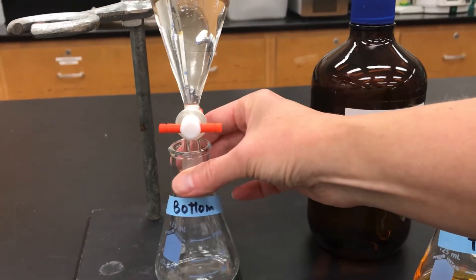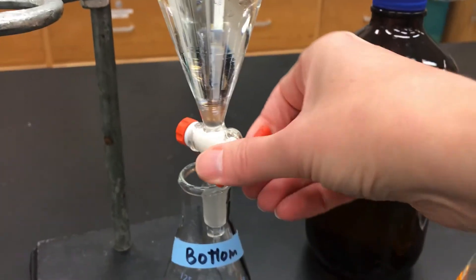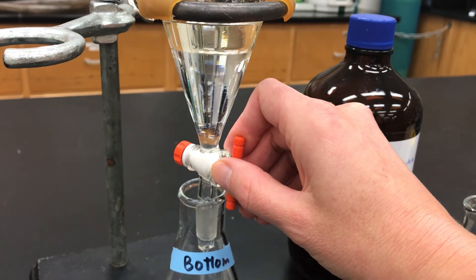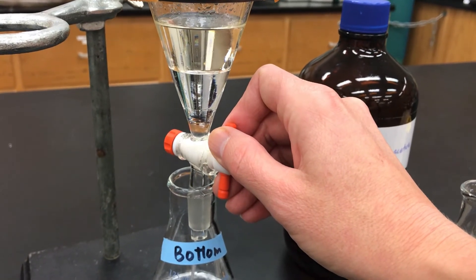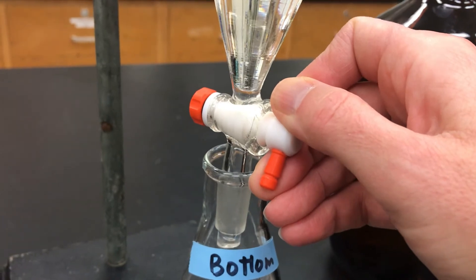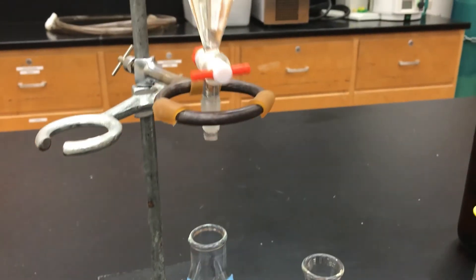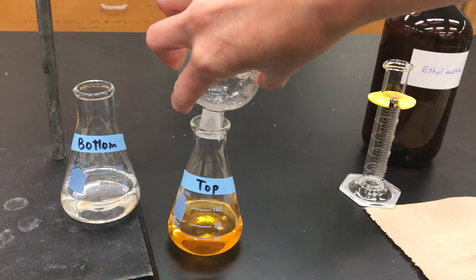After that second extraction, you want to separate the layers the same way as before. Take off the stopper and drain out the bottom layer, stopping when the interface is right at the stopcock. I go a little slower as it nears the stopcock and then stop right there. Then I pour out the top layer and combine it with my previous top layer, because the goal is to pull molecules into that top layer as much as possible — they're all the same thing, so you may as well combine them together.